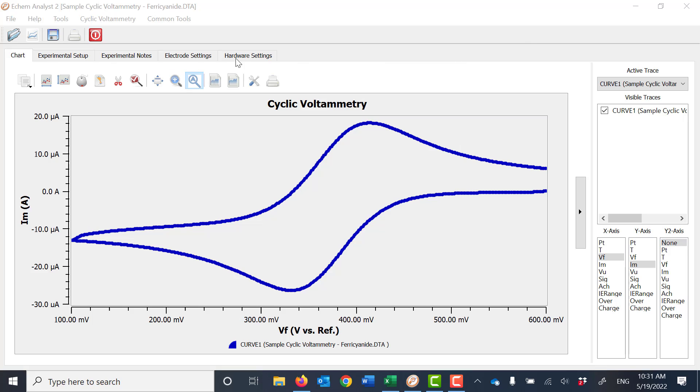If we are looking at a data file, in this instance it's a cyclic voltammogram of ferricyanide, you can choose to plot the data whatever way you would like. But whatever data you see on screen, that XY data or XYY data will be copied to clipboard.